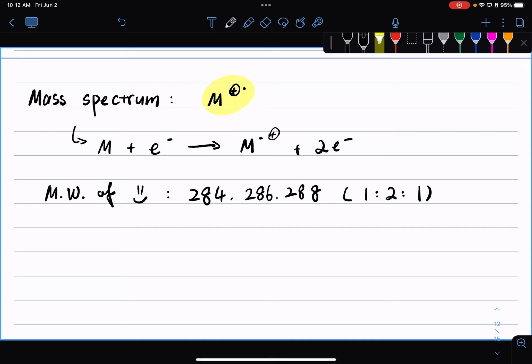Now this is peculiar because we know it has halogens, but how come we have 3 peaks for my molecular ion? Right, if you think about it, if we only have 1 of these halogens, like 1 chlorine, you would expect a 1 to 3 ratio of peak sizes on your molecular ion. If you have 1 bromine, you would expect a 1 to 1 ratio.